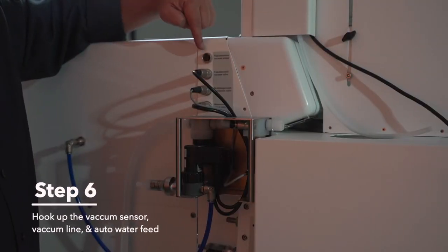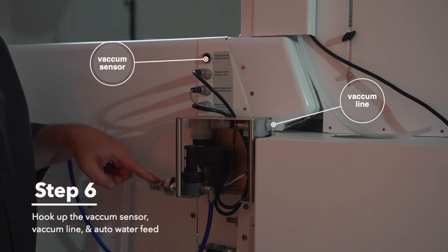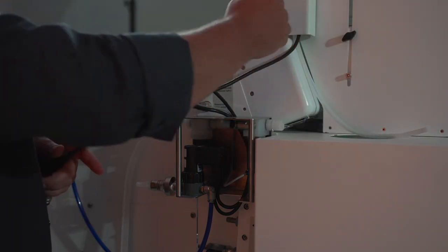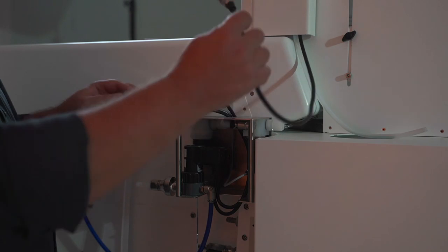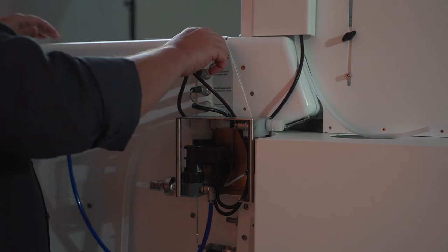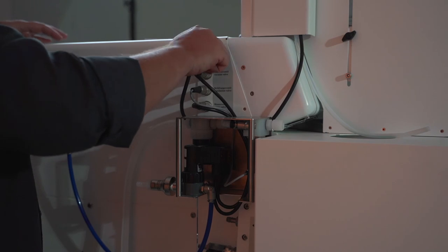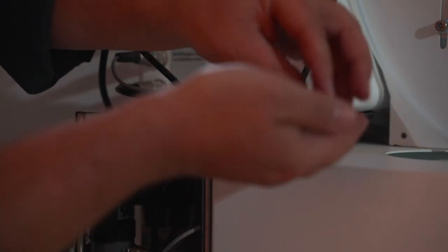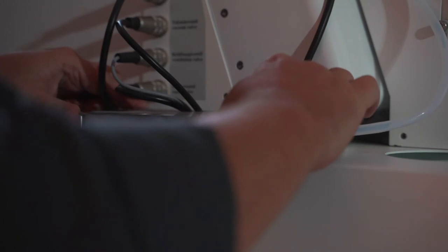Step six, we're going to be hooking up the vacuum sensor, our vacuum line, and if you'd like, you could also hook up the auto water feed feature. Your two lines coming out of the back of the column: this is your vacuum sensor — run it underneath those other connectors, plug it in, and screw it in. After you connect your vacuum sensor, you're going to want to connect your vacuum line. Remove your cap and ferrule, put that over the tube, slide the tube into position, and screw your cap in place. Now your vacuum line is all hooked up.